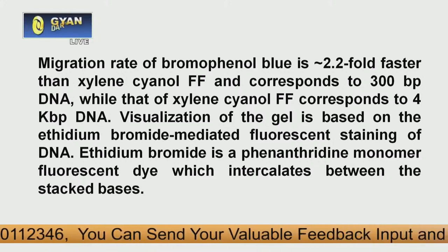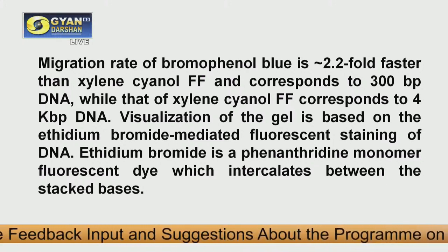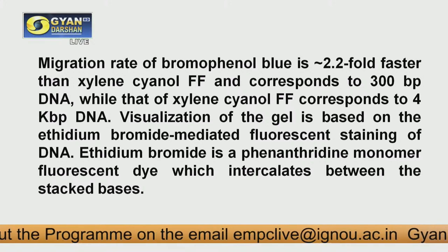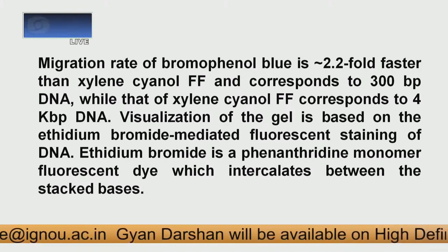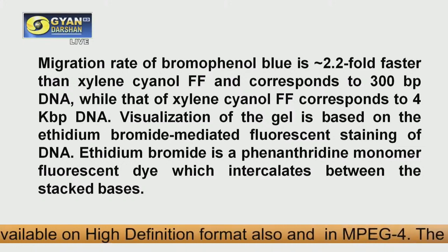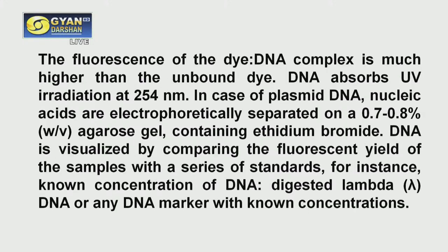Now you know what is the size of your plasmid, and accordingly you will run the gel. I mean, you will keep notice on these two dyes in the gel, and accordingly you can plan how much time you will run the gel. Make sure that the DNA does not come out of the gel in the electrophoresis buffer. Then you will not be able to visualize the DNA. Okay. So that is the importance of these tracking dyes. And with regard to the fluorescence, I already told you about the ethidium bromide that you are using.